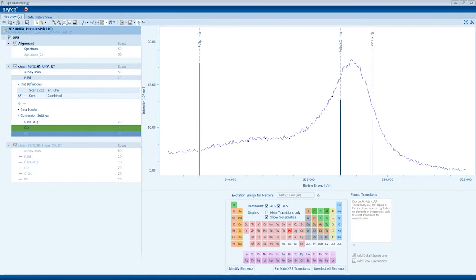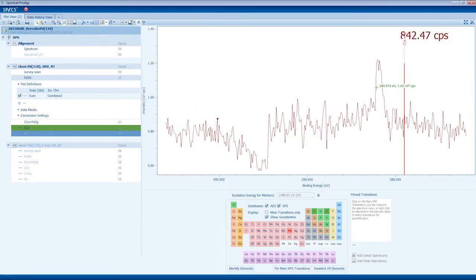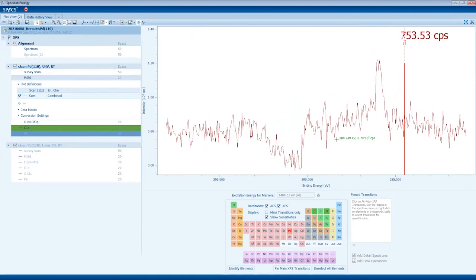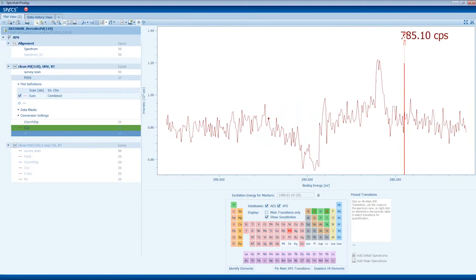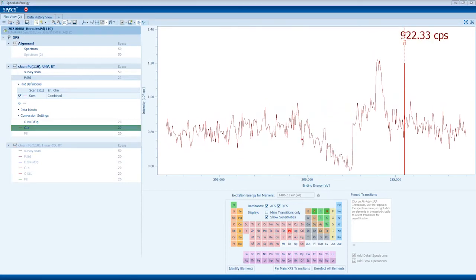We technically evaluated with Misha to be sure that you are not requesting unusual temperatures or some abnormal pressures, that it's actually possible to conduct the experiment with this facility without any trouble.